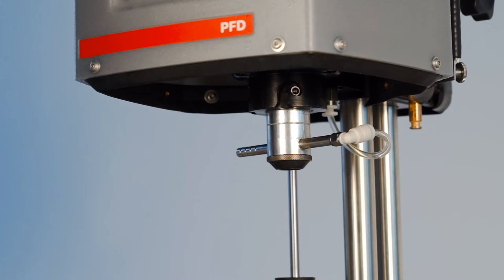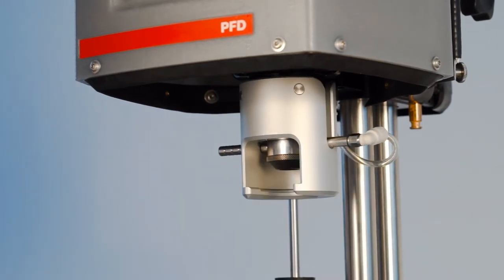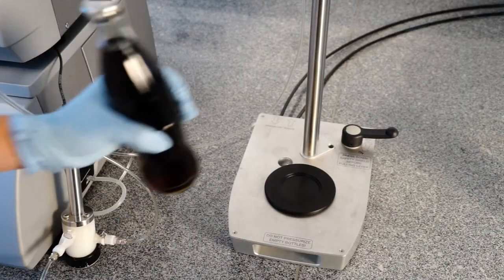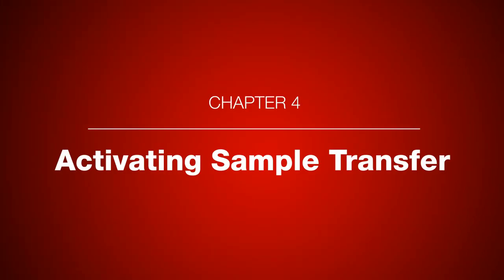For PET bottles, please install the adapter on the piercing and filling device. Cans need to be placed upside down. Glass bottles can be inserted as they are. For proper sample transfer, the filling device needs to be adapted according to the sample container.